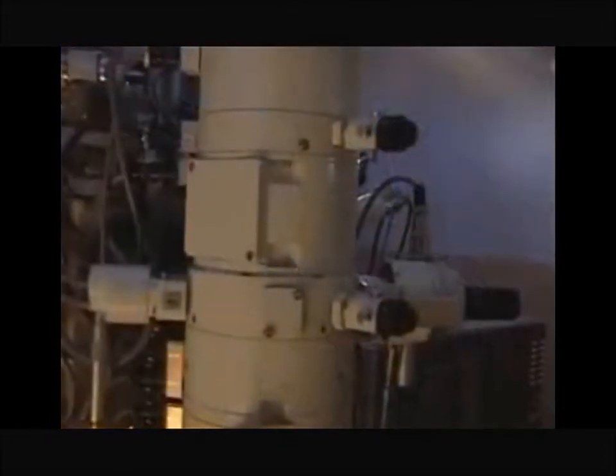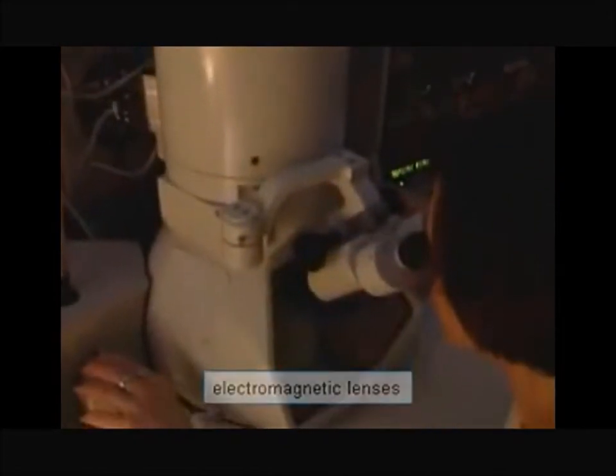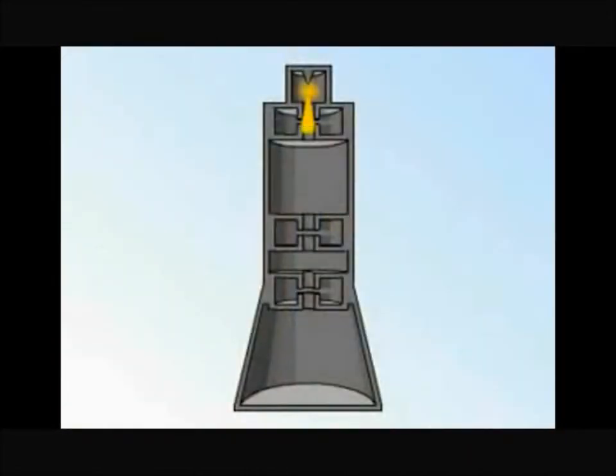The beam is maintained along the tube by means of electromagnetic lenses. These are coils that surround the tube at given intervals. The electromagnetic field emitted by the coils focuses the beam at the center of the tube. Electrons encounter the specimen and are either absorbed, scattered, or pass through it.